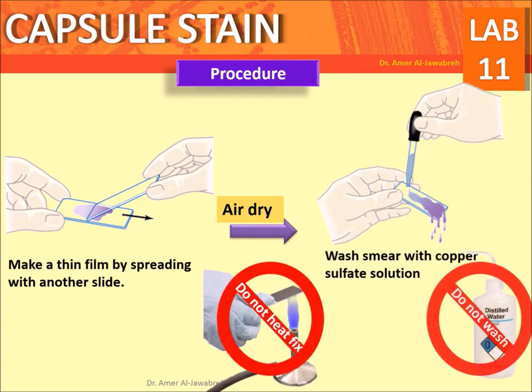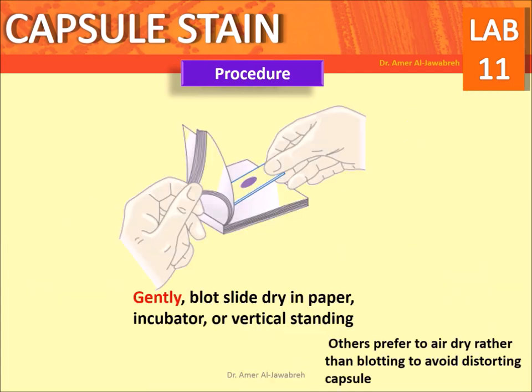Do not wash with distilled water to avoid removal of the capsule. Gently blot the slide dry using paper or stand it vertically. Some prefer to air dry rather than blotting to avoid distorting the capsule.